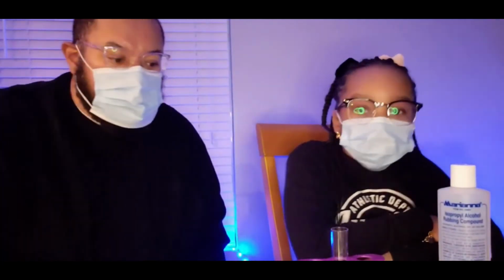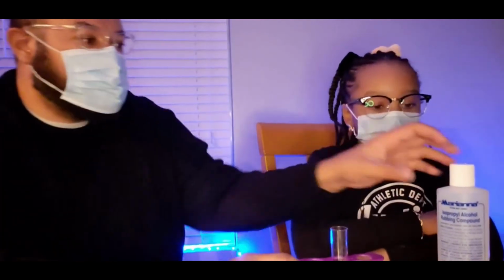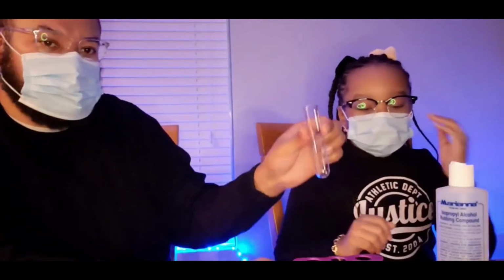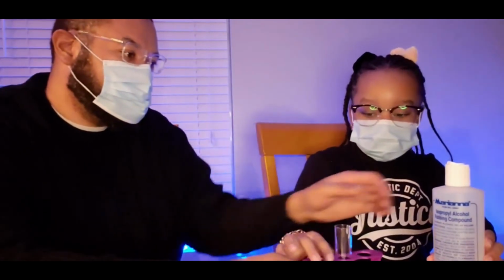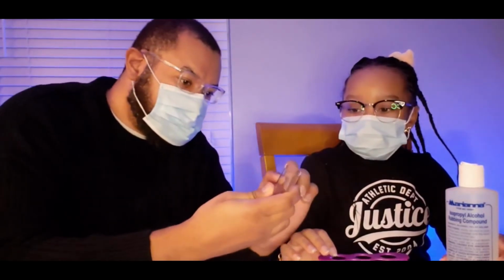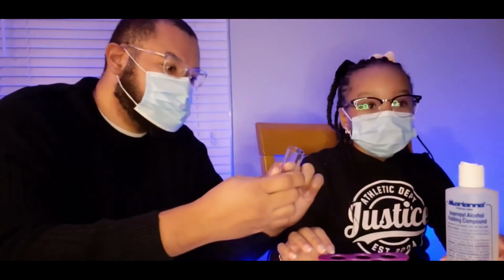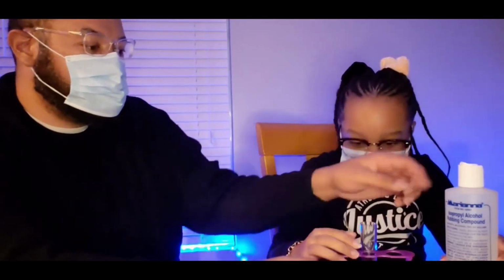All right, guys, we're back again. As you can see, we got our mask on, so our PPE, our protective equipment. We got our mask, we got our glasses. So we got the alcohol, Brooklyn. Let's go ahead and pour some into the test tube. We're gonna fill it up to 25 milliliters. So go ahead. It's gonna be right here. So go ahead and pour the alcohol. Go ahead and start pouring.